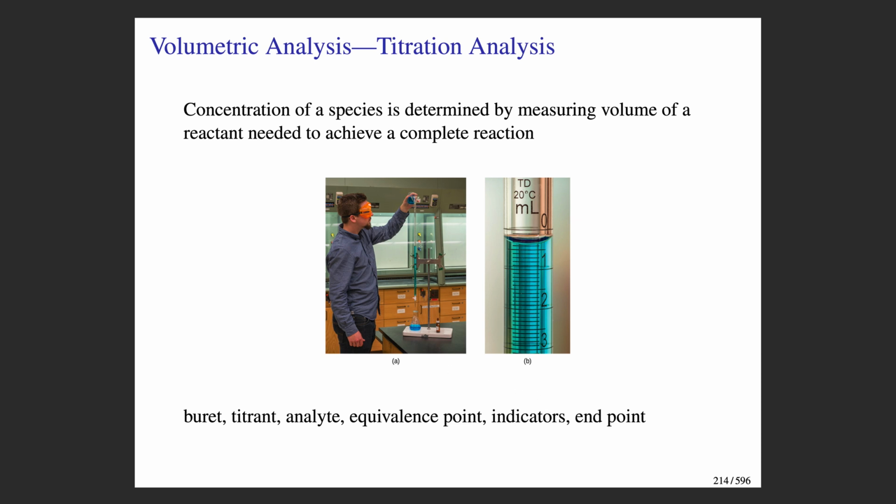Okay, so the burette allows you to deliver or to measure the volume of the titrant that's required to react with the analyte. And so we'll be working some problems that illustrate this process.